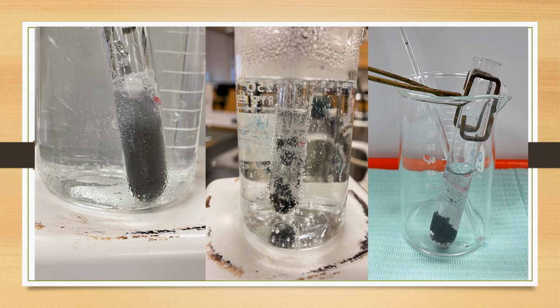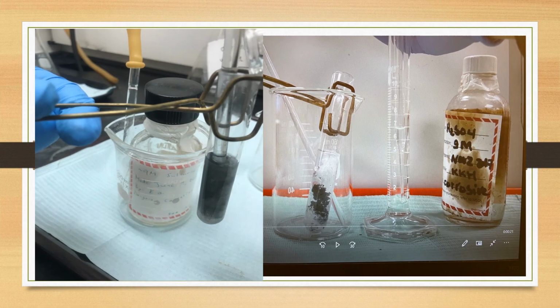beaker on the benchtop. In the next step, add 2 ml of 9 molar sulfuric acid to the test tube, and this addition causes 2 sequential reactions. Both of these reactions are exothermic. The initial addition of the sulfuric acid forms the gelatinous precipitate of aluminum hydroxide.